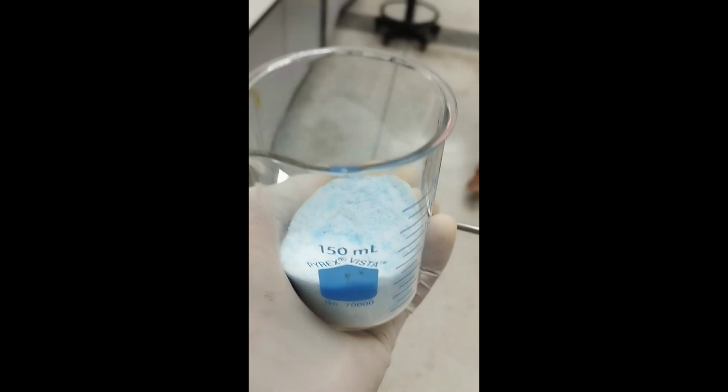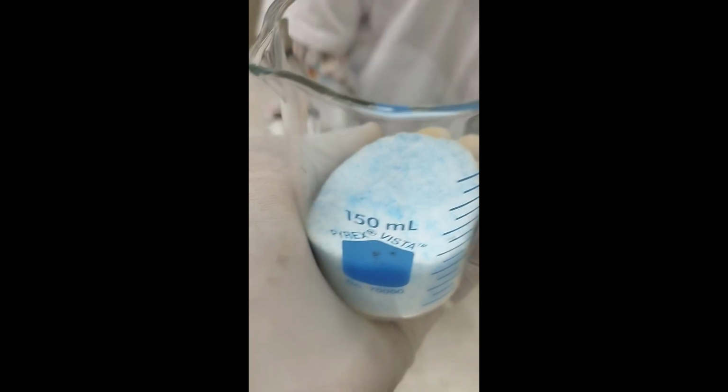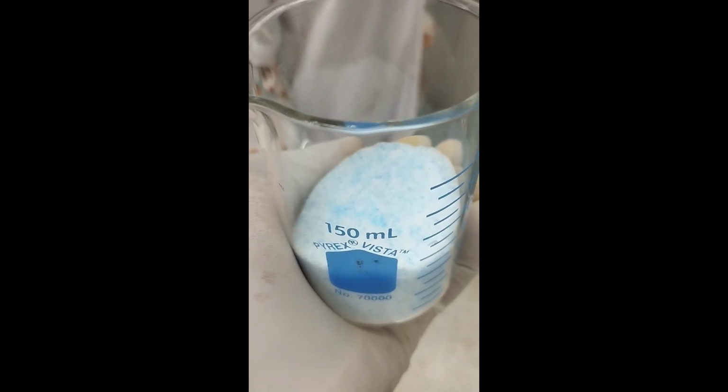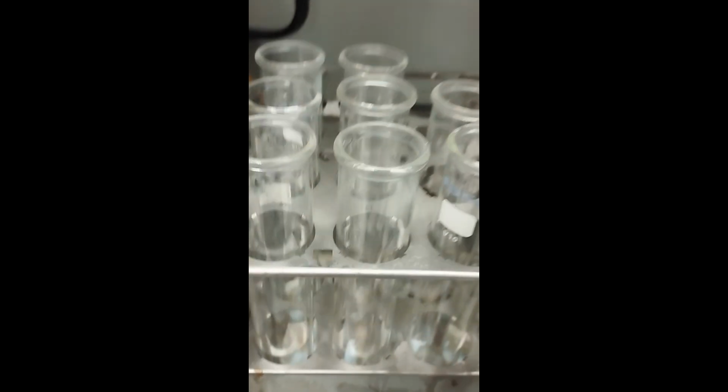This one is potassium sulfate and copper sulfate. Copper sulfate 0.8 gram per sample and potassium sulfate 7 gram per sample. Now I have to fill this sample after weighing into these digestion tubes, right?